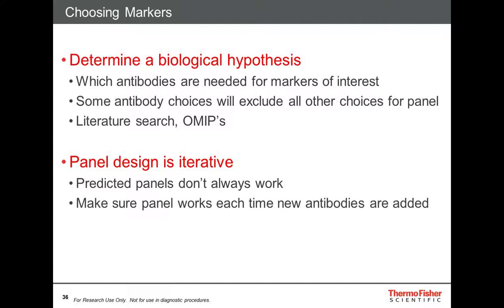But the most important thing is that panel design is iterative. Predicted panels are exactly that. They're predicted panels. And no matter how much expertise you have, I can give you a predicted panel, but I can't tell you if it's going to work or not with any confidence. I used to teach week-long courses in flow cytometry, and every single class, there'd be people disappointed at the end that I couldn't hand them a panel that worked.